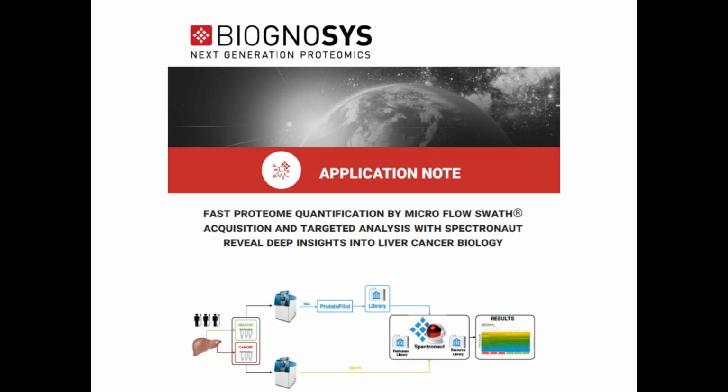Certainly, when we look at peptide levels, we can see sub-femtomole, high attomole levels of peptide quite clearly. It's not the dramatic loss in sensitivity that most people think when they switch from nano. So if you are used to using nano and want to switch to a higher throughput, you're not going to be compromised too much on overall sensitivity.